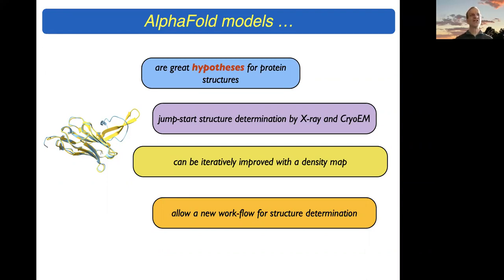may continue to put side chains in wrong conformations, even if you give it the right ones, because it doesn't notice the side chain conformations that you give it. It only uses up to the C beta, so it doesn't even know what the side chain conformation was. It throws it away. So even if you keep fixing a certain lysine, it's going to put it back where it wants to go, not necessarily where you put it.